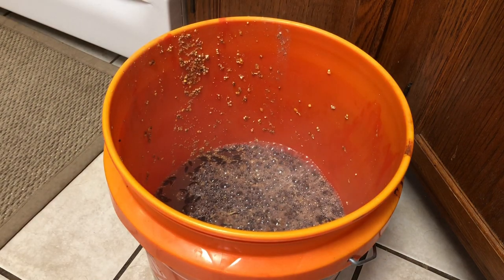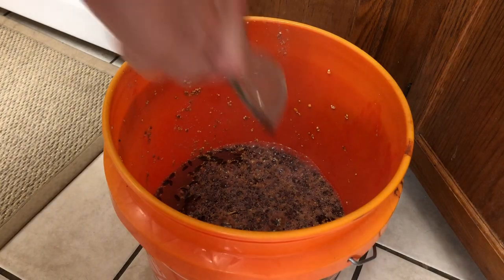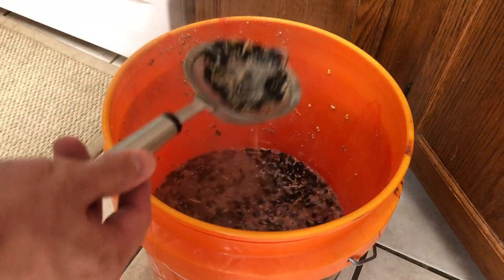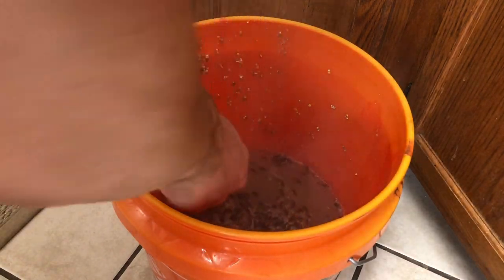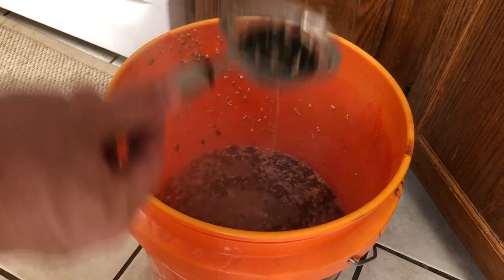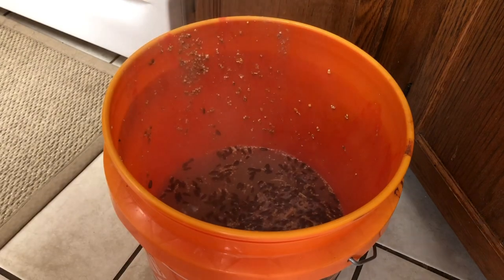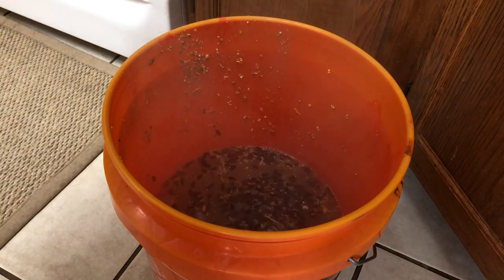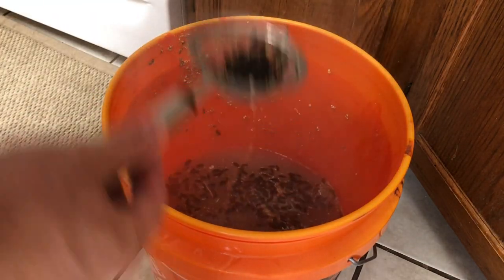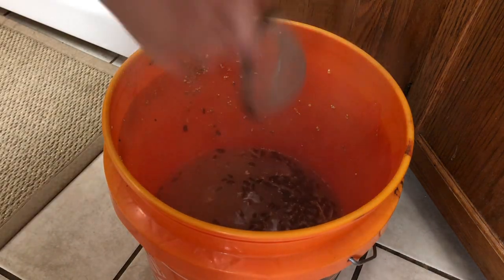All right, so from here, you can use an aquarium net if it's metal, or you can use one of these little metal strainers, doesn't really matter. You just need something, and you're going to simply scoop out the sunflower seeds. Now, technically you don't really have to scoop them out. The problem is they can become mushy. The mycelium won't really colonize it very well. It's also black, so it just kind of looks funky. Kind of can look like contamination, but it's not a very good nutrient source for mycelium.